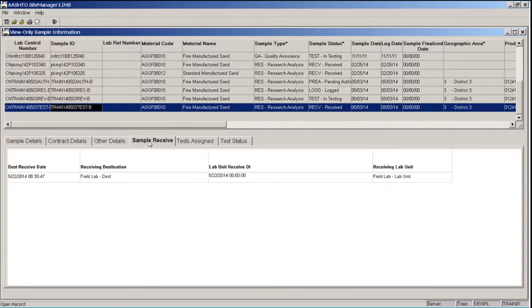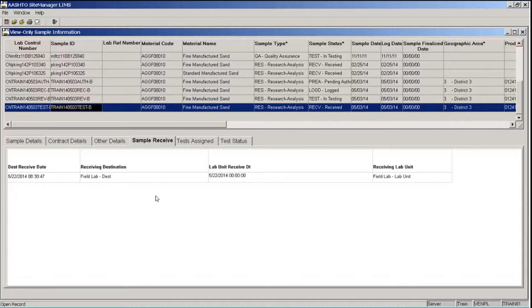The Sample Received tab will show the date and time that the sample was received in the destination lab and or lab unit.